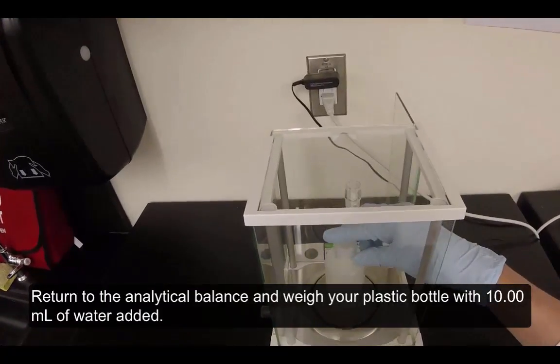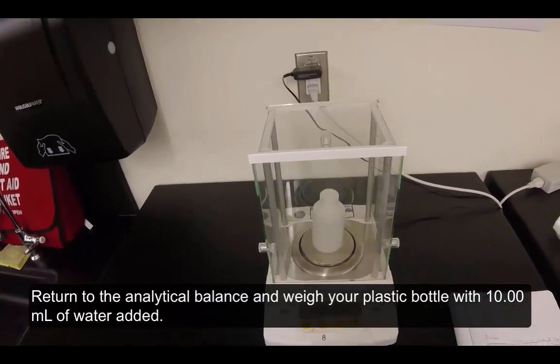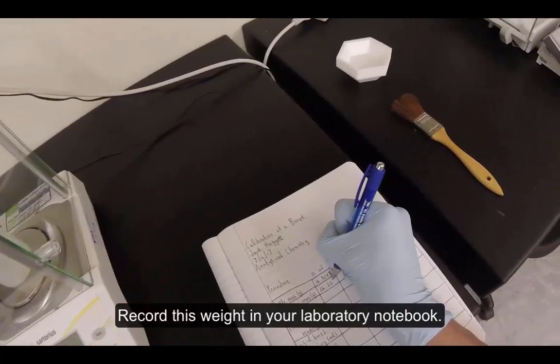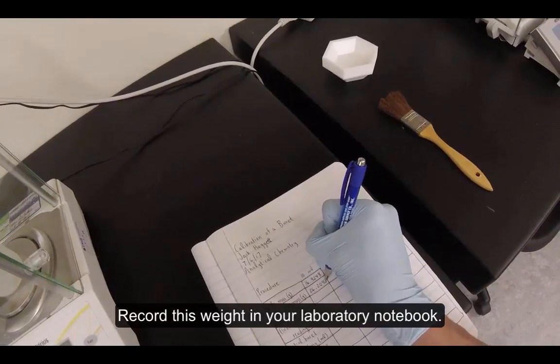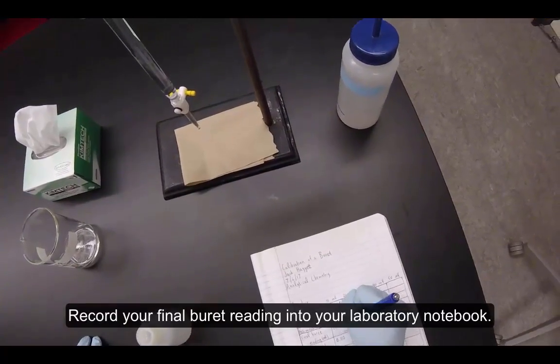Return to the analytical balance and weigh your plastic bottle with 10 milliliters of water added. Record this weight in your laboratory notebook. Record your final burette reading into your laboratory notebook.